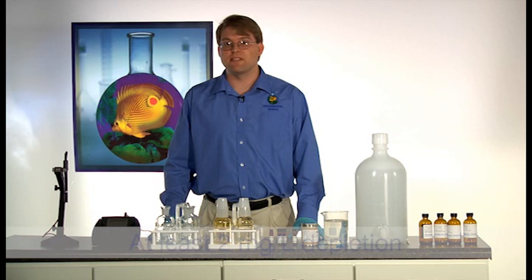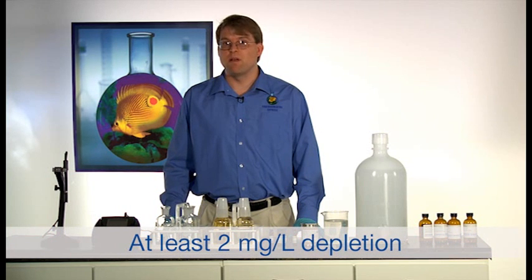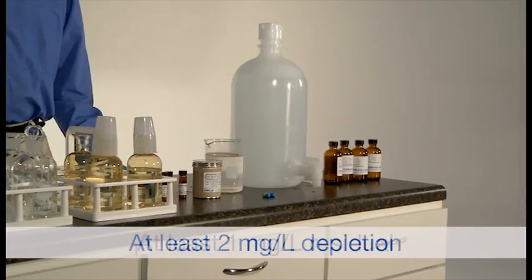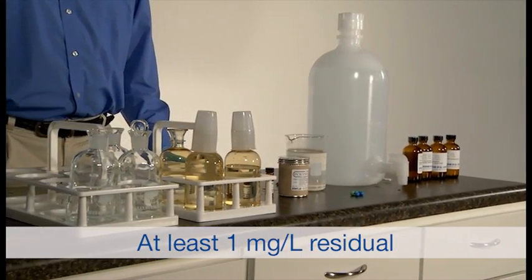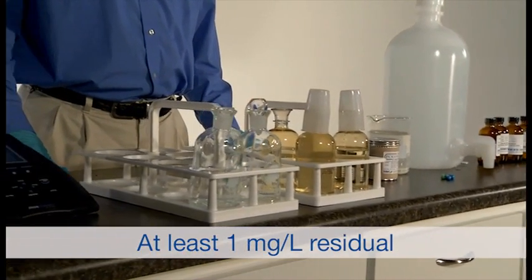In order for a sample to be acceptable, it must have a minimum of 2 mg of oxygen per liter depletion and a residual of at least 1 mg of oxygen per liter remaining. This is known as the 2 to 1 rule.